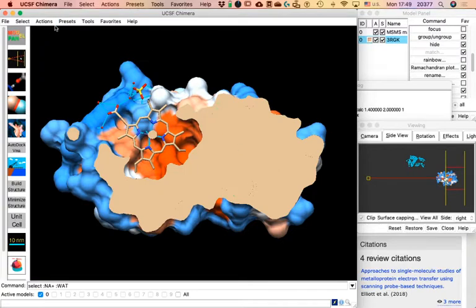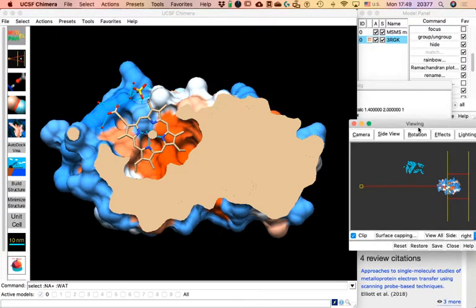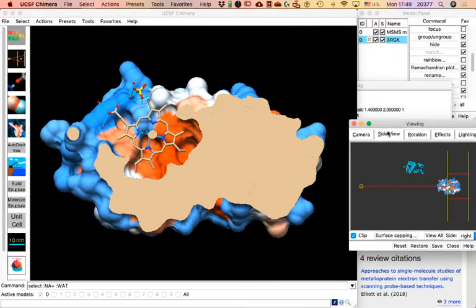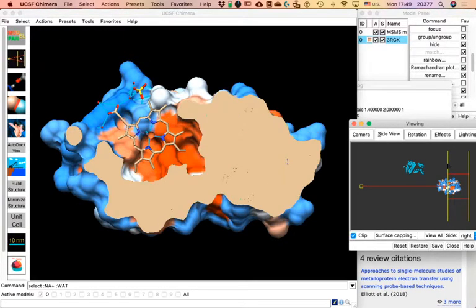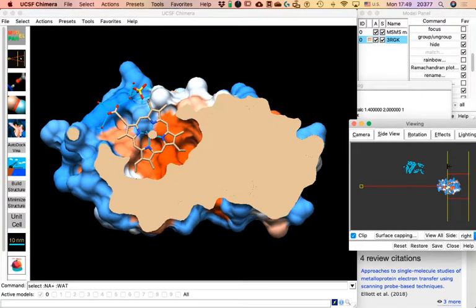Go back to Focus so you are centered. Go to the Side View menu/window and the Side View tab and move the yellow line. What you'll be able to do is take slices out of the protein and look at the inside.